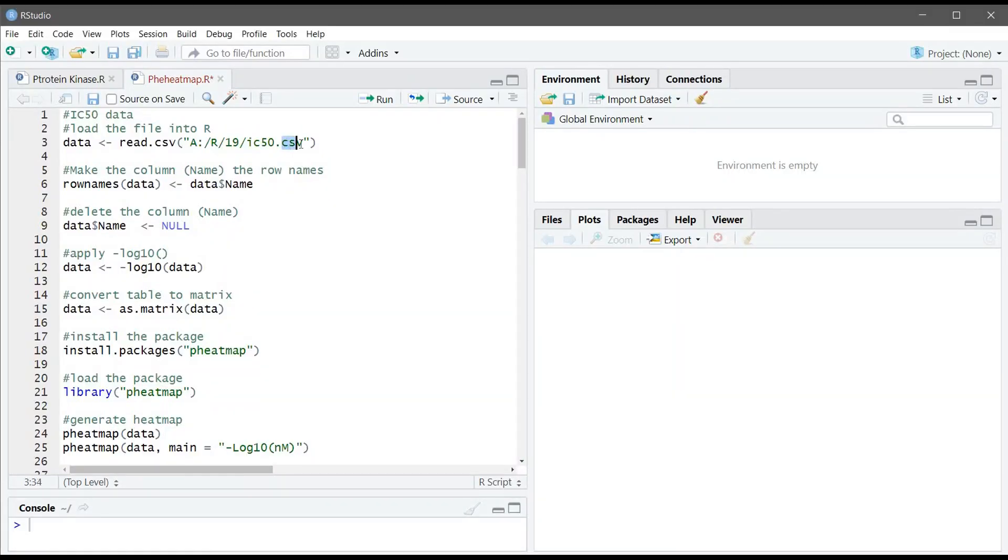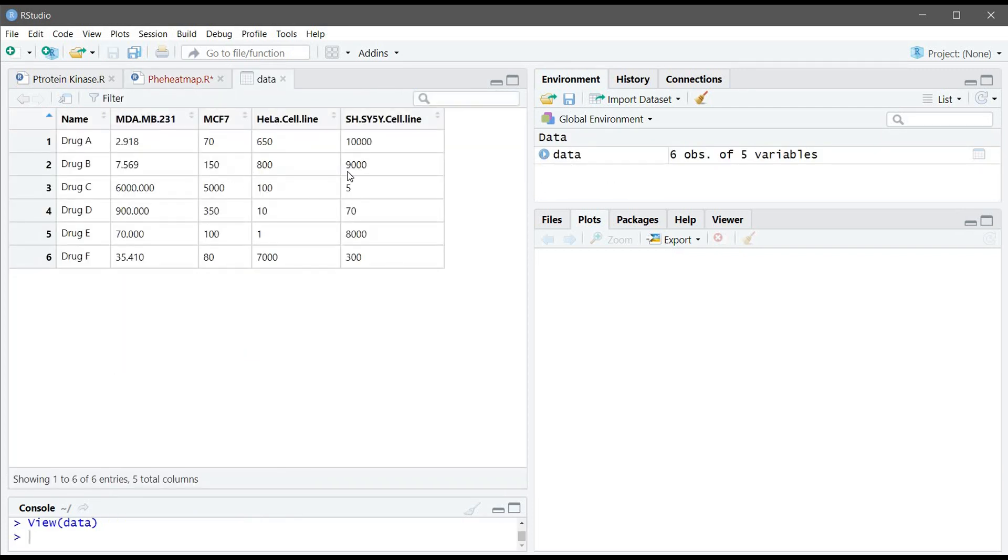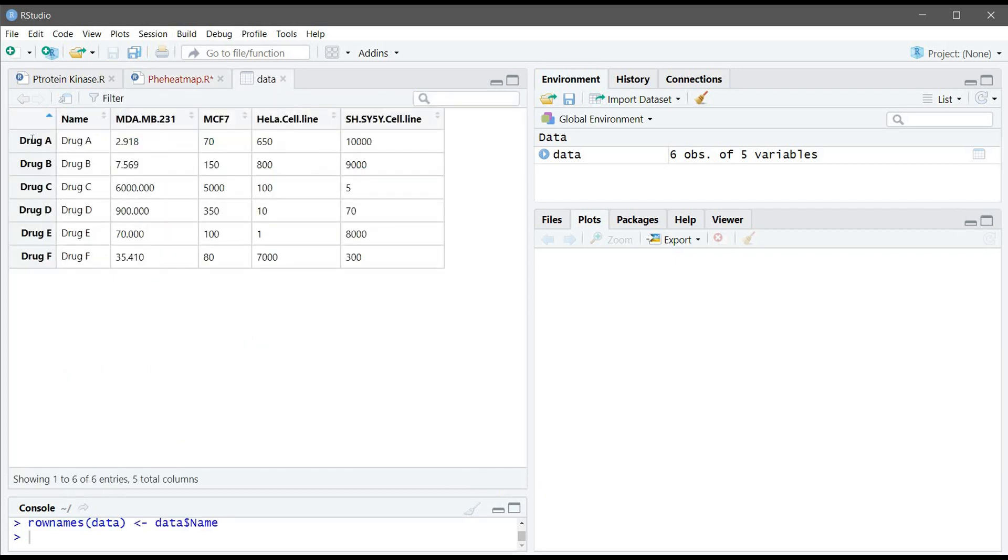So now you've saved your file in CSV format. We will use the read.csv function and we will load it into R so we can look at the table. First thing we need to do is we need to convert the first column into row names. So we'll use the rownames function and convert it. We can see we have row names now with the drug names, but still we have this column so we will delete this one.